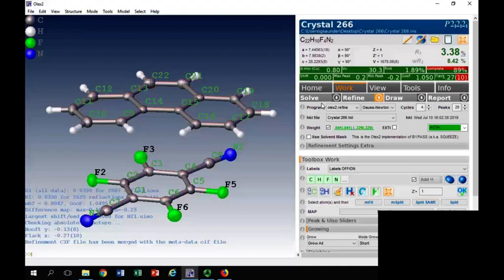Okay. Remember that the formula at the top, at the beginning, might be wrong. Use your chemical nous. In the past, someone thought they had a salt. They didn't spot that it was a cation, and rather than having a bromide anion, they had a selenium atom.